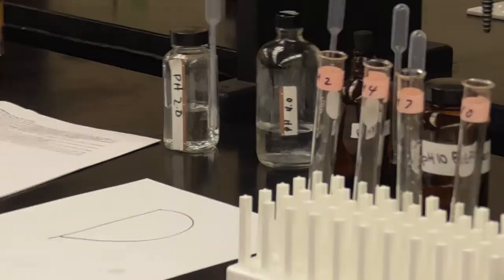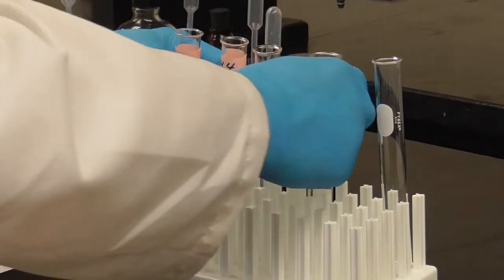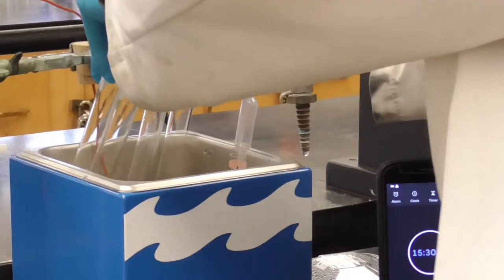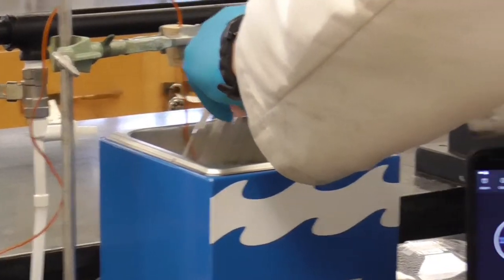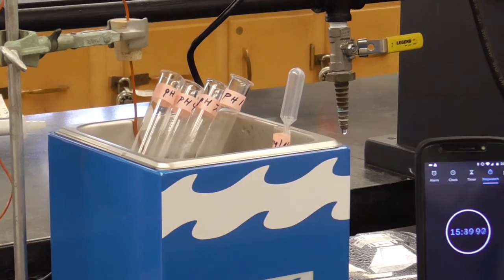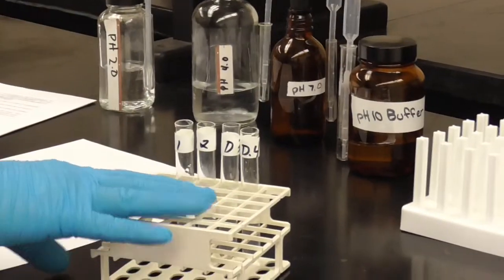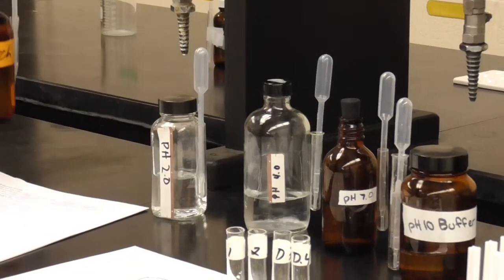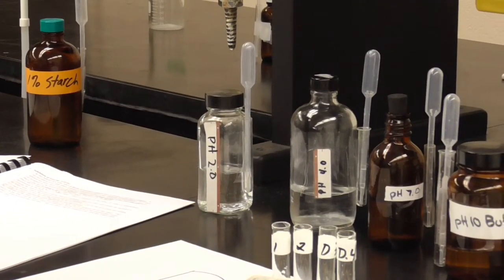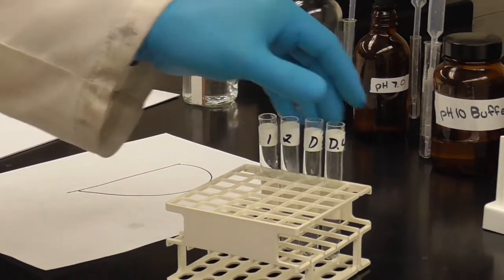From the previous part, we saw that 37 worked fairly well for enzyme body temperature. So we're going to go ahead and take those and put them in our 37-degree water bath. And I'm going to see if I can just kind of balance them in the back here, since those test tubes are actually too big to fit in my little rack. But yeah, that seems to work. It's not the prettiest, but it works. All right, also, we have our substrate, the starch solution, and we're supposed to put 3 milliliters into each one. I've done that ahead of time just to save a little time, so we're going to go ahead and put those also at 37 degrees.